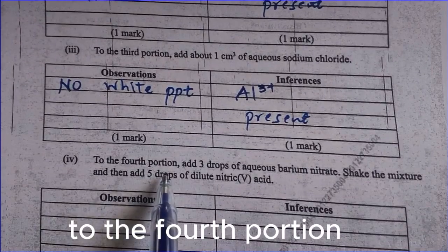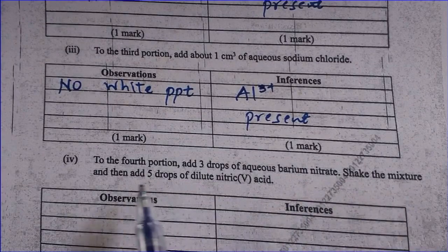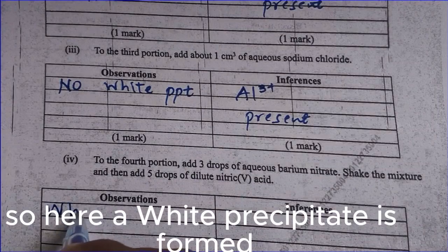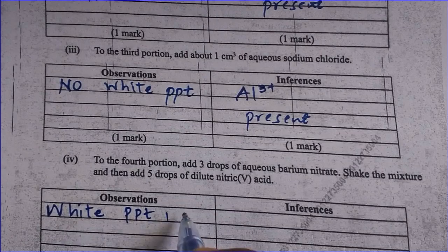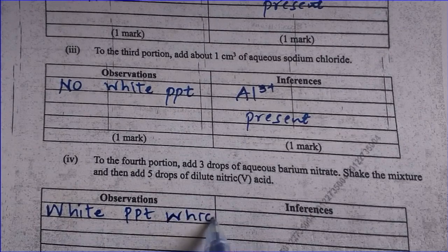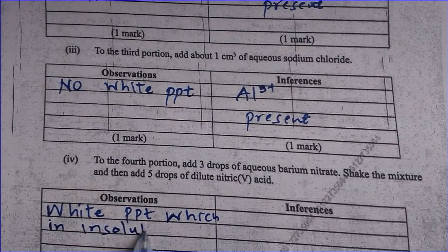To the fourth portion, add 3 drops of aqueous barium nitrate, shake the mixture, and then add 5 drops of dilute nitric acid. So here, a white precipitate is formed, white PPT, which is insoluble in nitric acid.